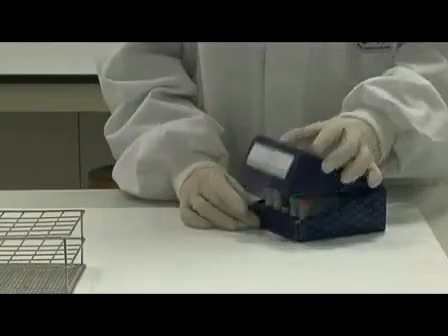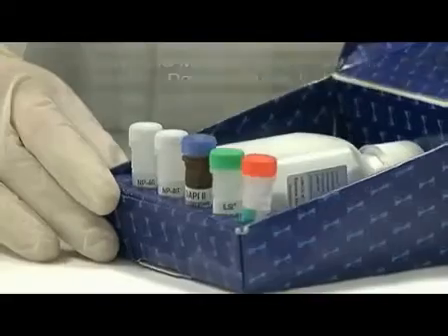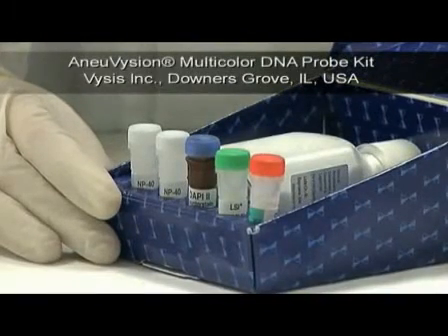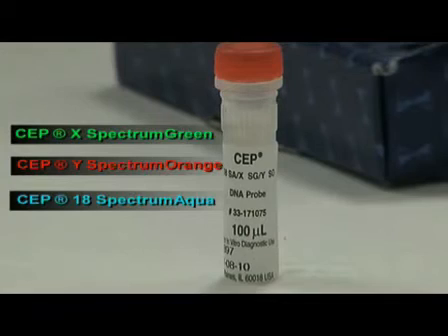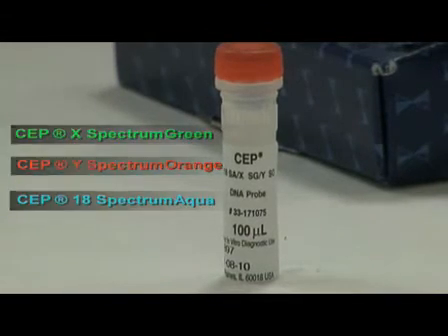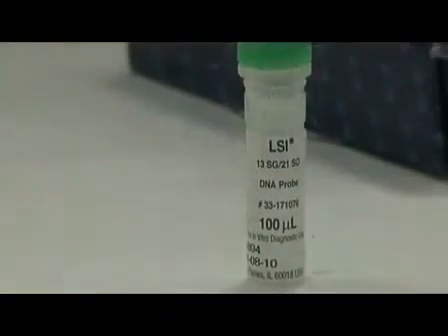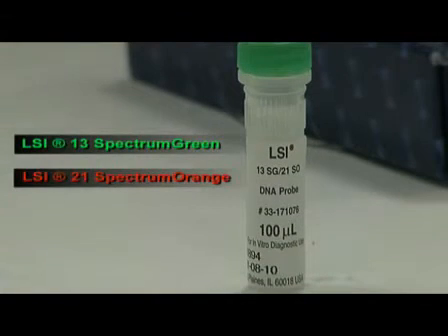To analyze these chromosomes, we will use a multicolor DNA probe kit from VYSIS. This contains one vial with a probe combination for the alpha satellite region of chromosomes X, Y and 18, labeled green, orange and aqua respectively. And another vial with a combination of probes for chromosomes 13 and 21, labeled green and orange respectively.